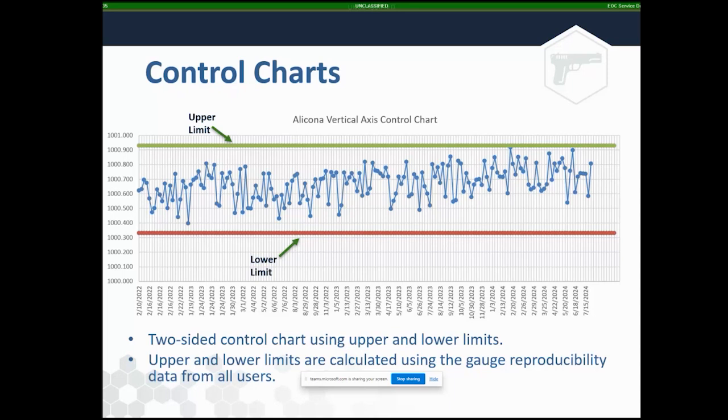And it really is ideal that you see there's a ton of flux in those measurements. That shows that the instrument is dynamic and operating correctly. You're not stuck in some sort of stagnant phase with your measurements, but everything is still falling within those limits. If at any point you saw that all of your measurements were hitting that upper limit, or really close to it, every single time you measured, that'd be a great time to assess the instrument and probably call your vendor and see what you can do about getting a calibration. So it's just kind of a warning zone if you saw that changing over time.